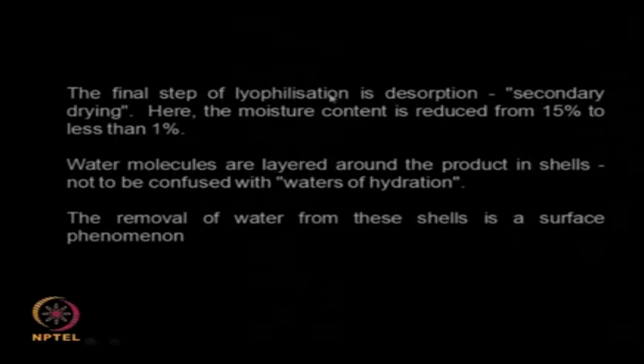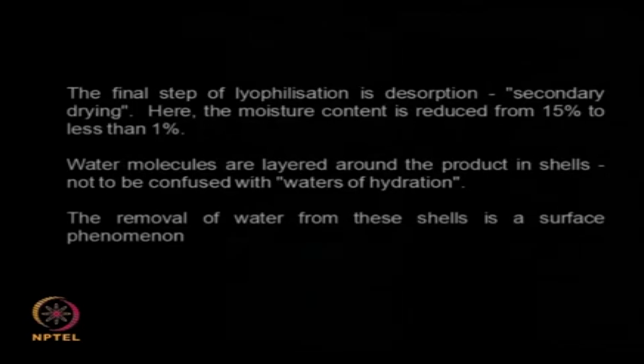The final step of this lyophilization, we call it desorption, or secondary drying, or drying to remove the bound water, so you reduce the moisture content to almost 1%. There is a lot of water present on the product in the form of a shell. Okay. It is a surface phenomenon, it is not a water of hydration. You should not confuse the removal of bound moisture with removal of water of hydration. It is more like water present in the form of a shell.